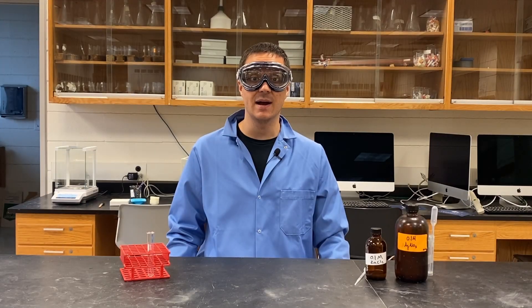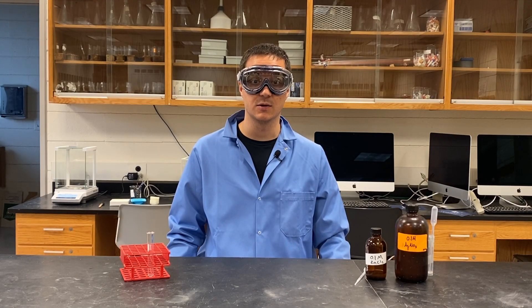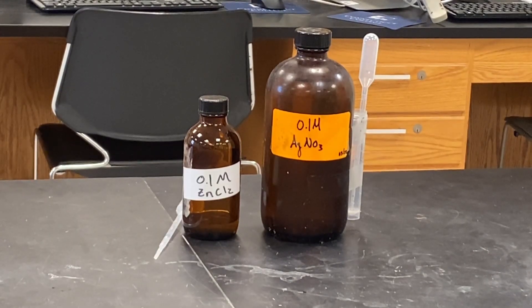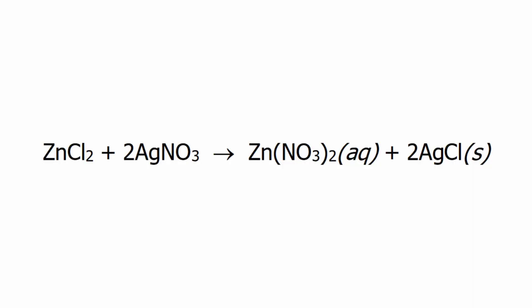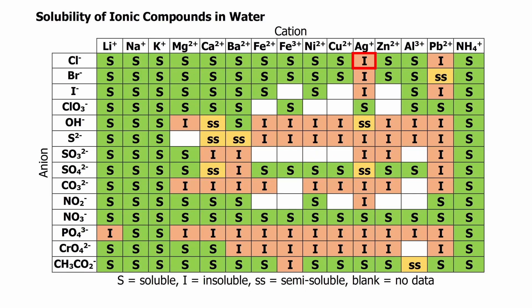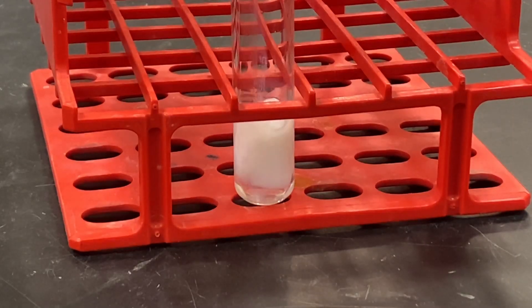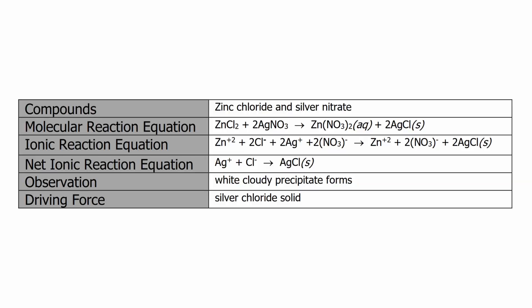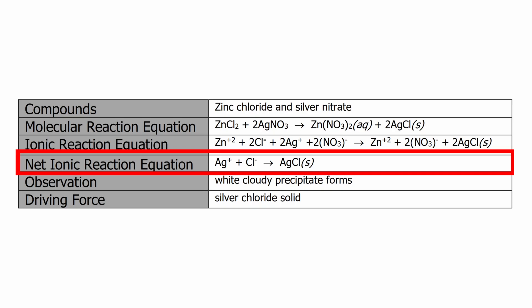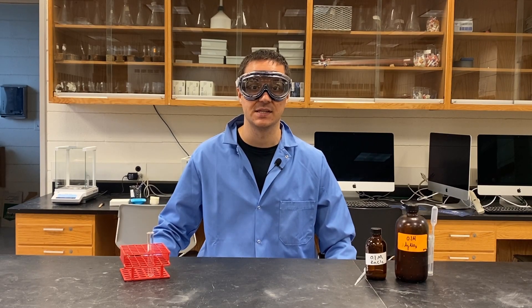In this experiment, you are asked to combine several pairs of chemicals and predict if a reaction will occur. I'll demonstrate with zinc chloride and silver nitrate. The molecular reaction equation for these compounds looks like this. By consulting my solubility table, I can see that silver chloride is insoluble. Mixing the two chemicals results in a cloudy white precipitate. In my notebook, I'll record a table including the ionic and net ionic reaction equations. The driving force here is the precipitation of silver chloride.